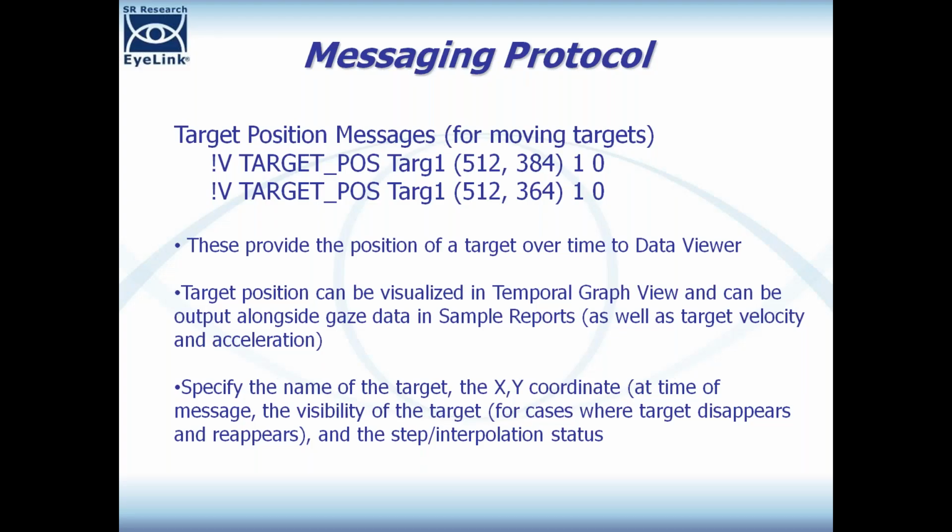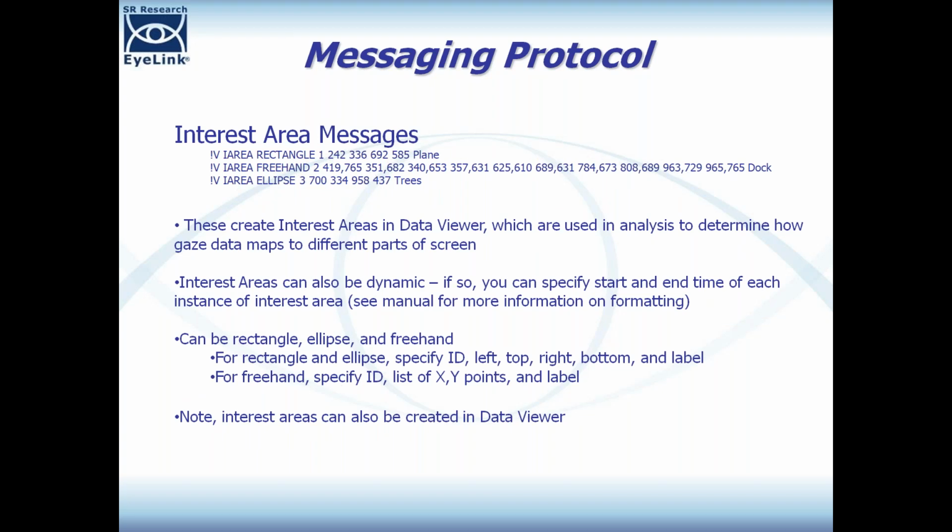Bring back the PowerPoint here. Then another thing you can do is send interest area messages. These messages will make it so that when you import the EDF file into Data Viewer, these interest areas that you specify will be loaded automatically and just ready to use in Data Viewer.